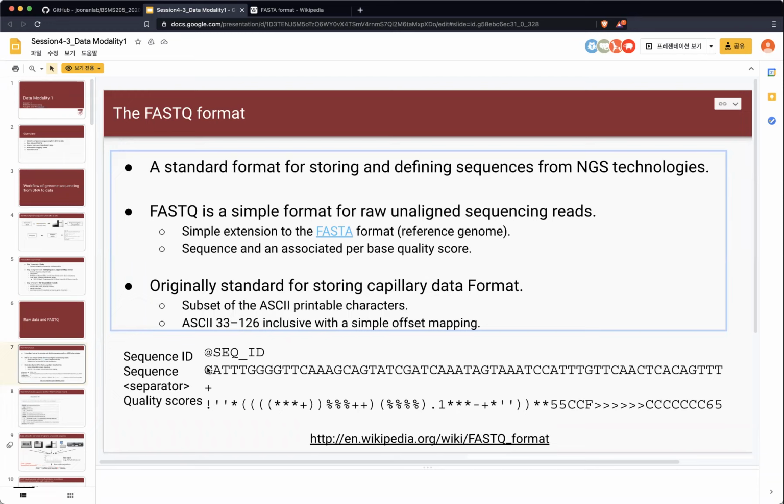So people had to come up with different ways to represent that quality information. Then we use symbols of a single character matching to the single nucleotide, right? So in that case, we use the ASCII notation, and this is the one way people conventionally use computationally. So people use ASCII characters for the quality information.